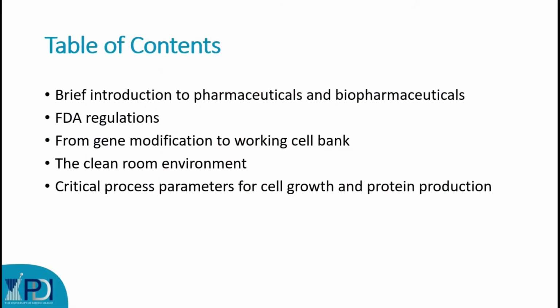In this course, Aseptic Upstream Processing, I will be discussing a few areas. The first being a brief introduction to pharmaceuticals and biopharmaceuticals. Secondly, I'll discuss FDA regulations that guide the aseptic upstream process. Then we will discuss from gene modification to working cell bank. This will give you an overview of genetic modification of the cells that will eventually be the workhorse of the biopharmaceutical industry and produce the therapeutic proteins that we're seeking.